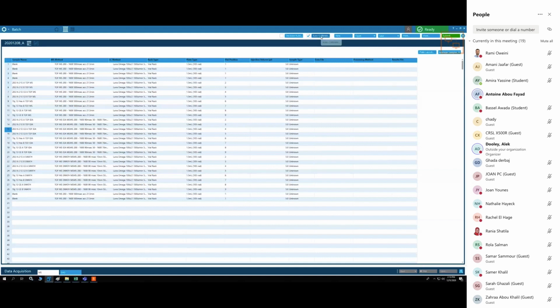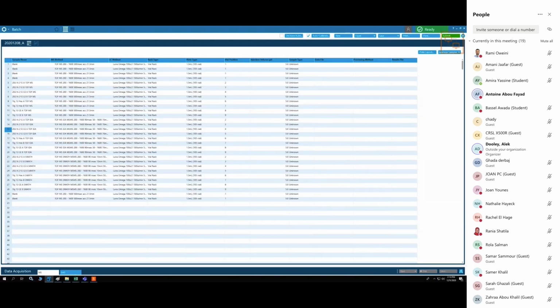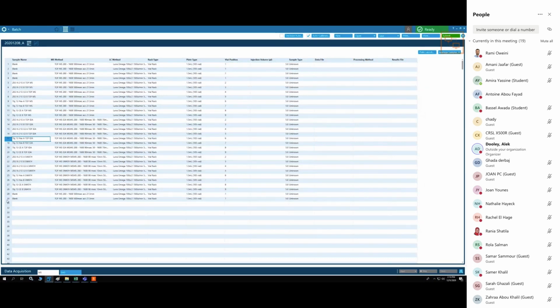The reason for that is that under the auto calibration, you just choose one. So you have to choose one mode, highlight all of that mode and submit it. Then you have to go back to auto calibrate and change it to your other mode. And don't forget to change the channel as well. And then highlight the second mode and submit.